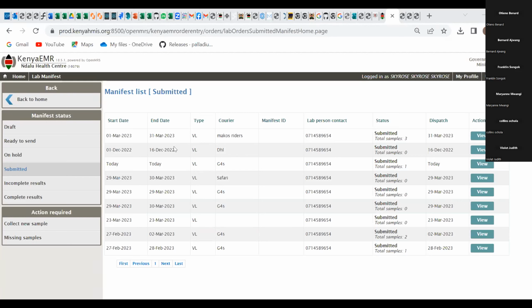Yeah, then there was the question around the null something, if I can scroll up. Yeah, the shipping ID is null. So for this, it's supposed to be captured if you are sending your samples to Cambridge Lab, using the labware. So it is only required for the labware.